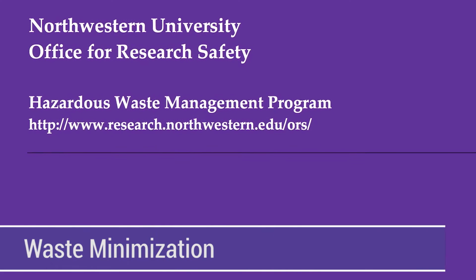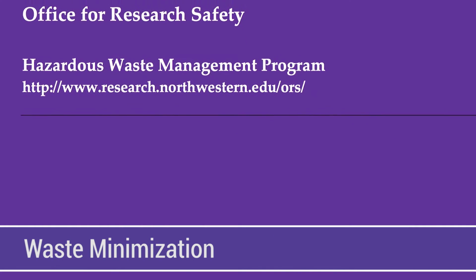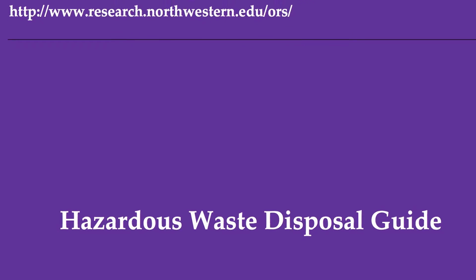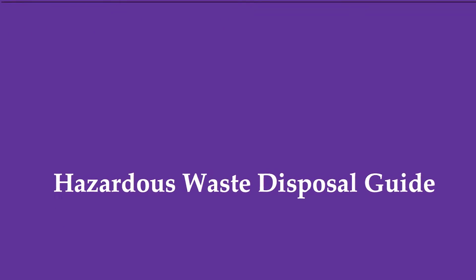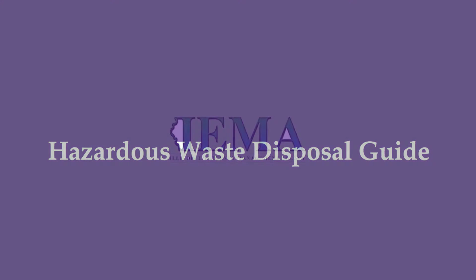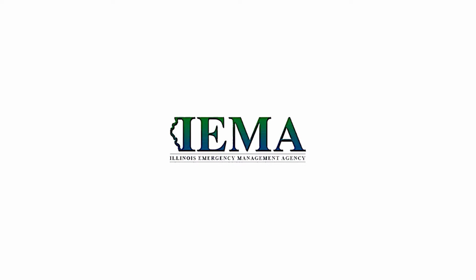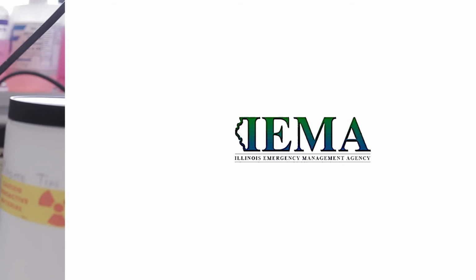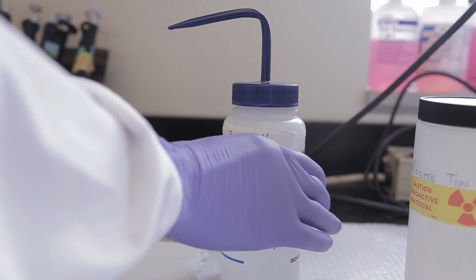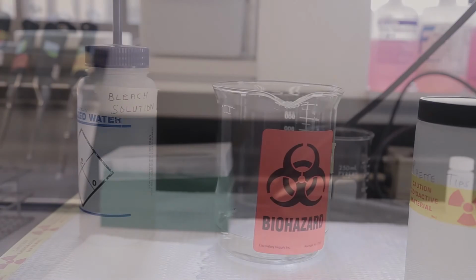Waste minimization is any action that decreases the amount of hazardous waste generated or reduces the inherent toxicity of the waste. Northwestern places a high priority on waste minimization and must annually report its efforts to reduce radioactive waste to the Illinois Emergency Management Agency, Division of Nuclear Safety. Only radioactive waste should be placed in radioactive waste containers.